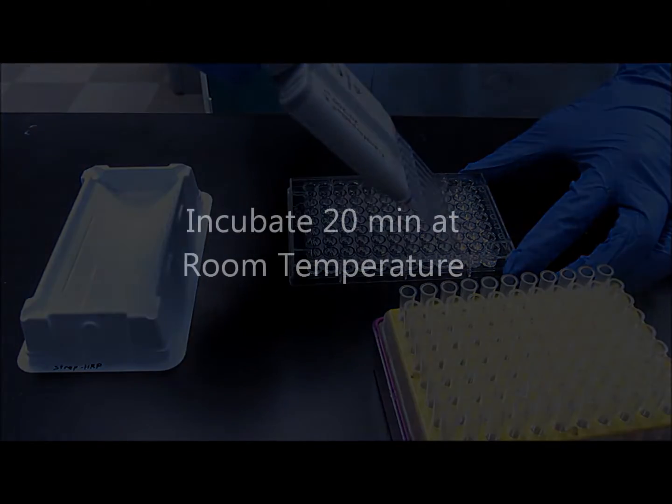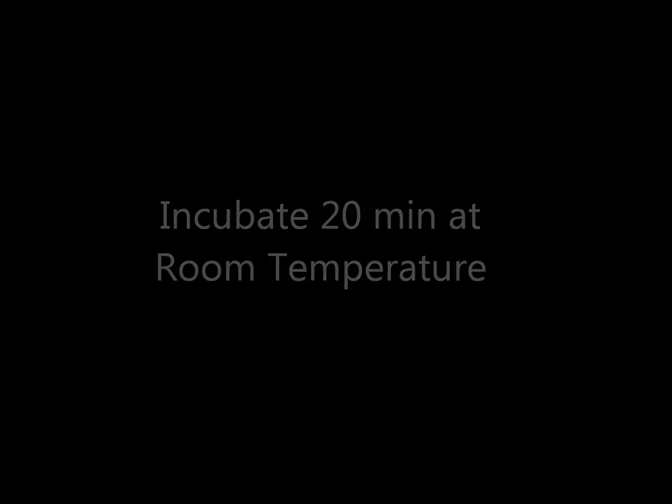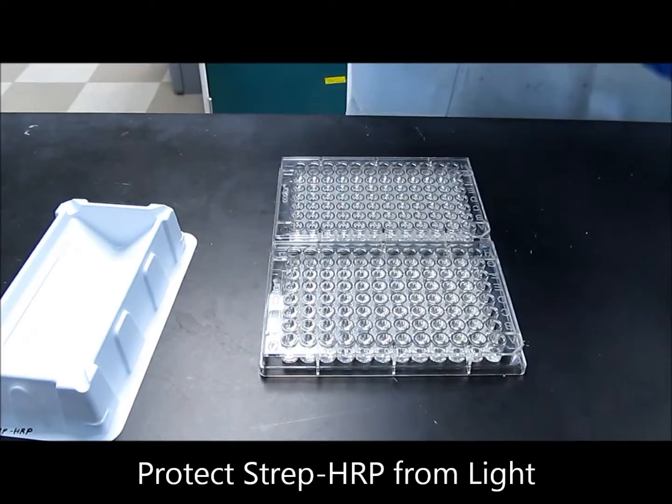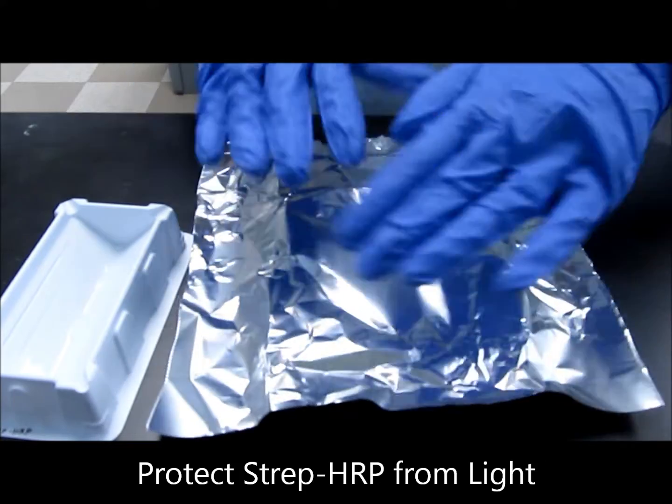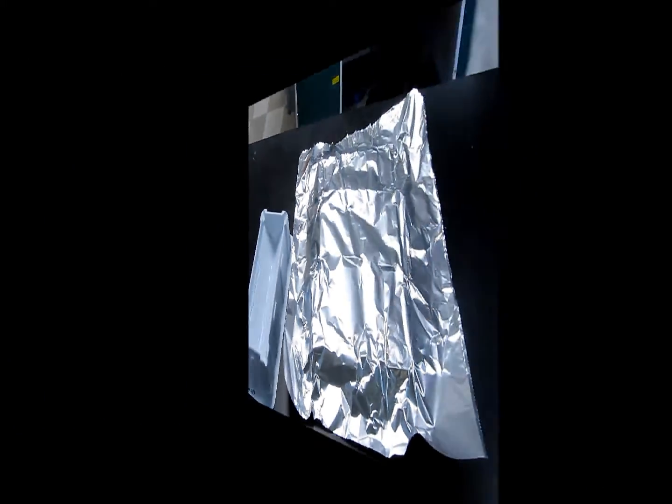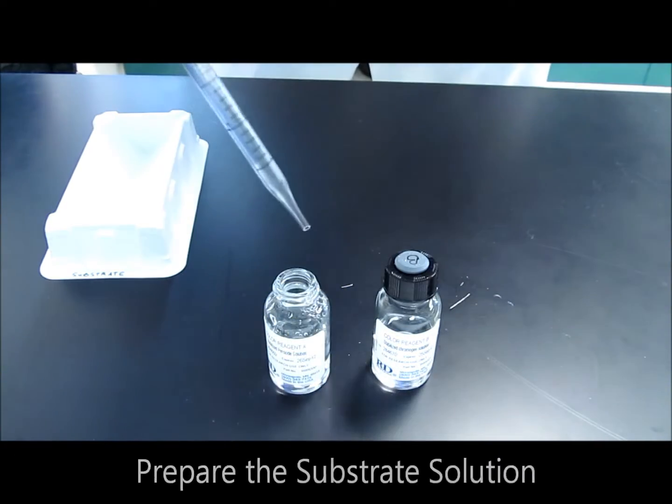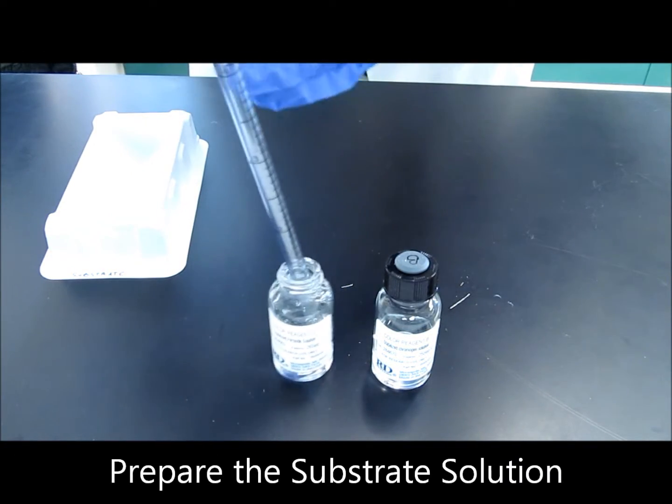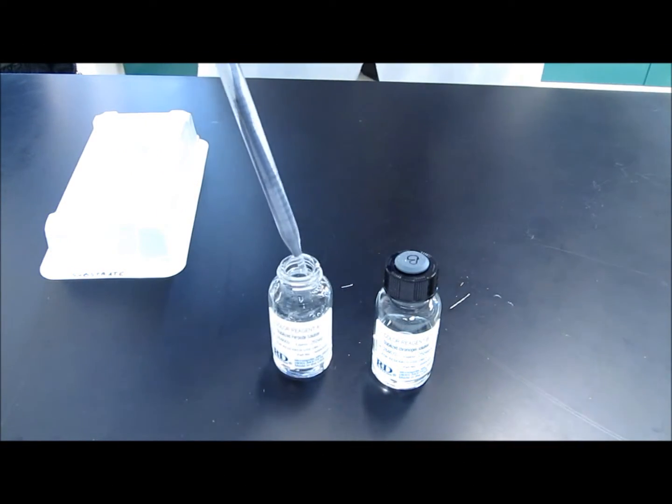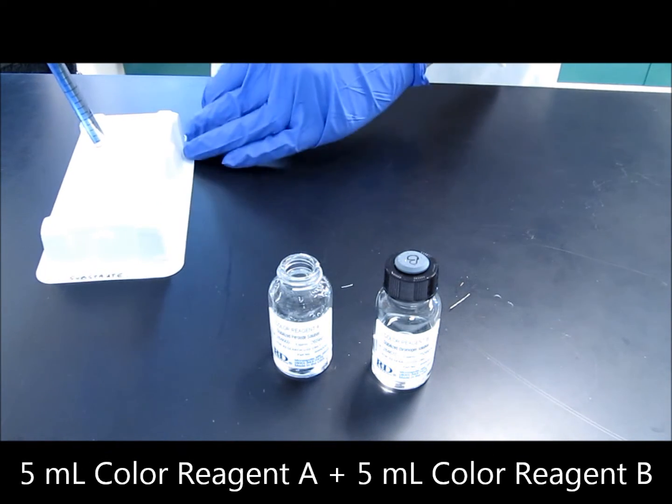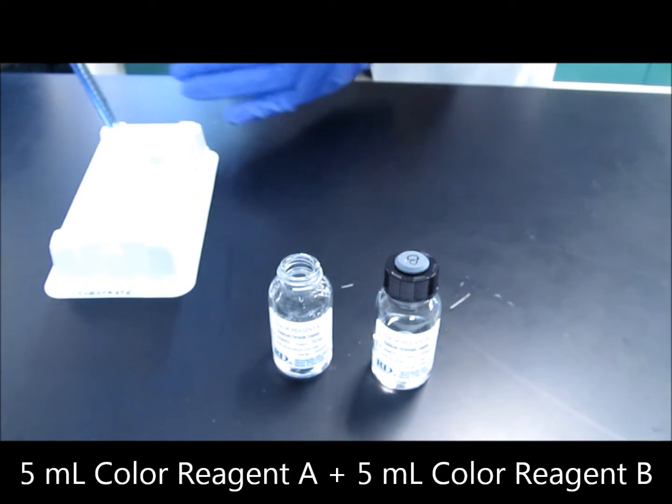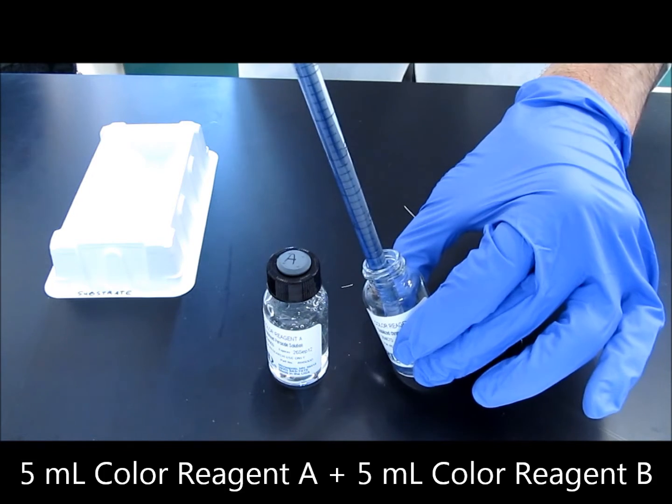Incubate this time for only 20 minutes at room temperature and be sure to protect the plate from light. This can be accomplished by covering the plate with some aluminum foil or a cardboard box. A few minutes before the 20-minute incubation is complete, prepare the substrate solution. For this protocol, you can simply combine 5 milliliters of color reagent A with 5 milliliters of color reagent B.